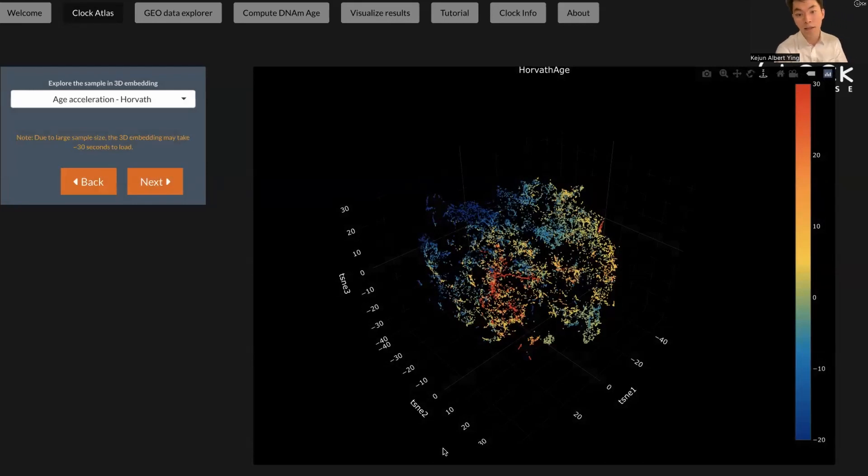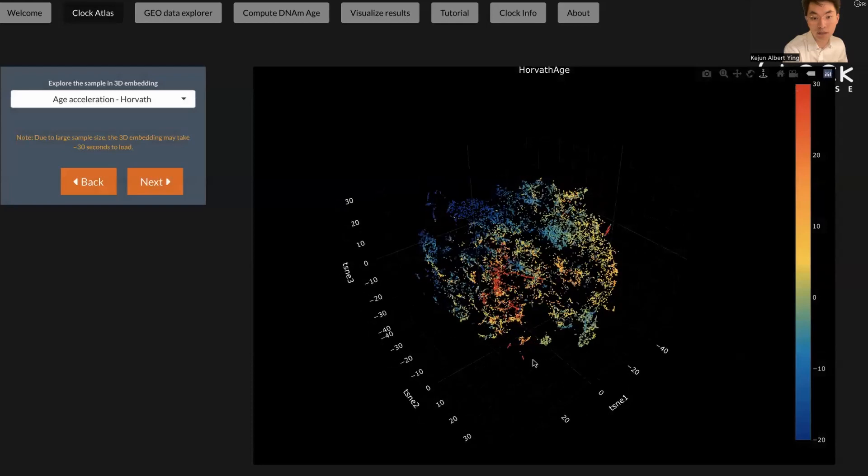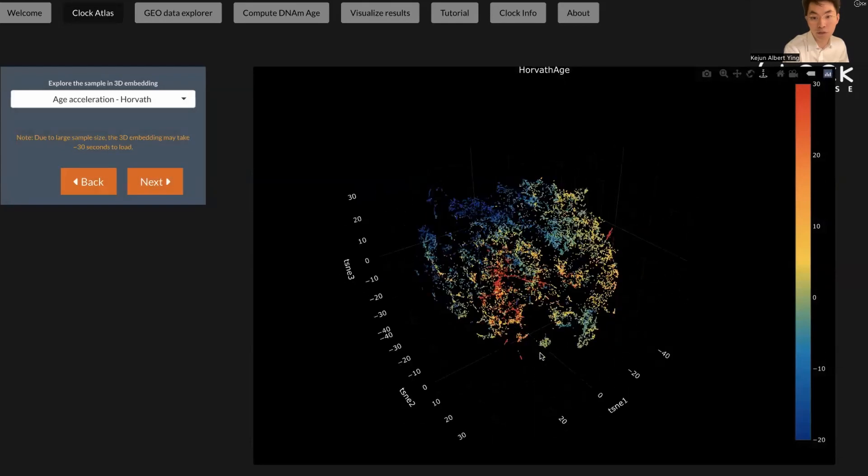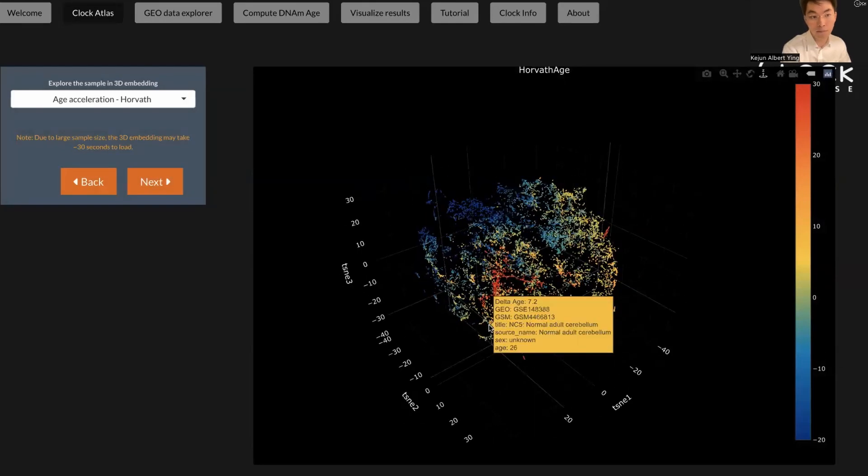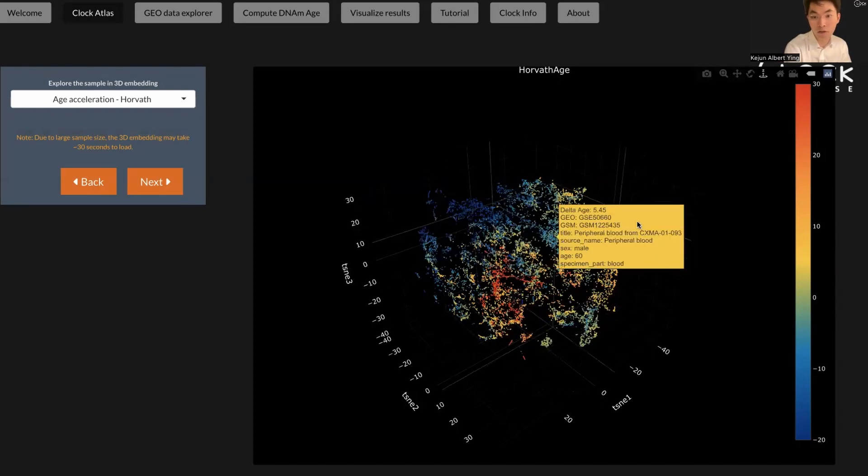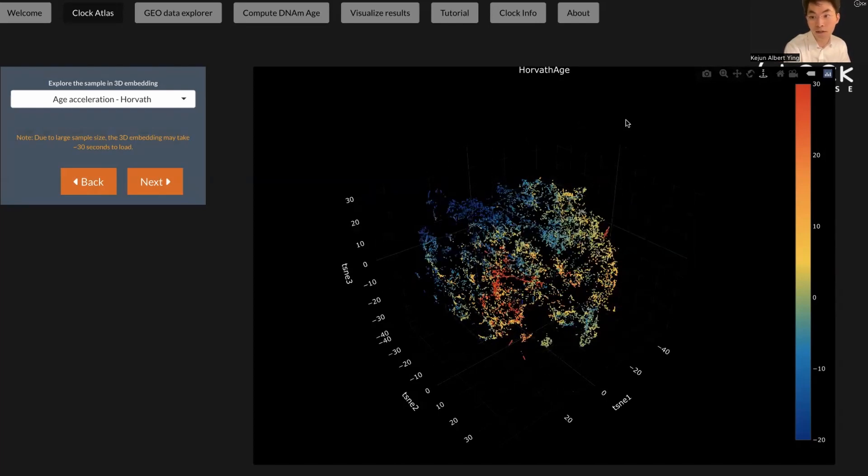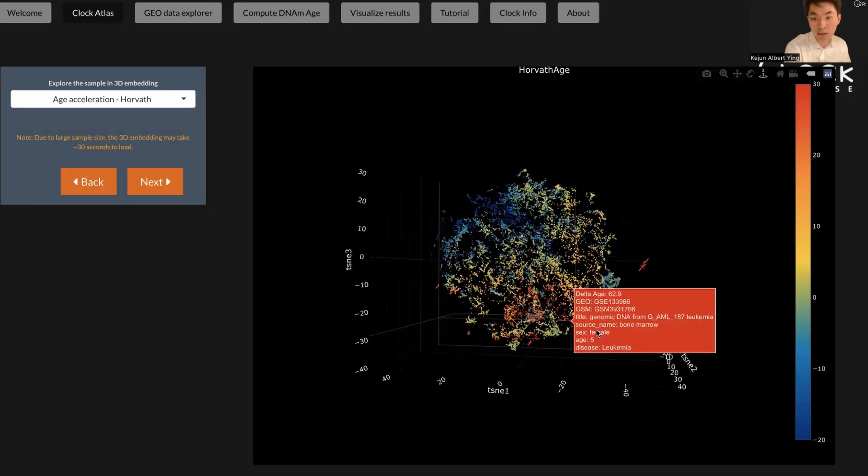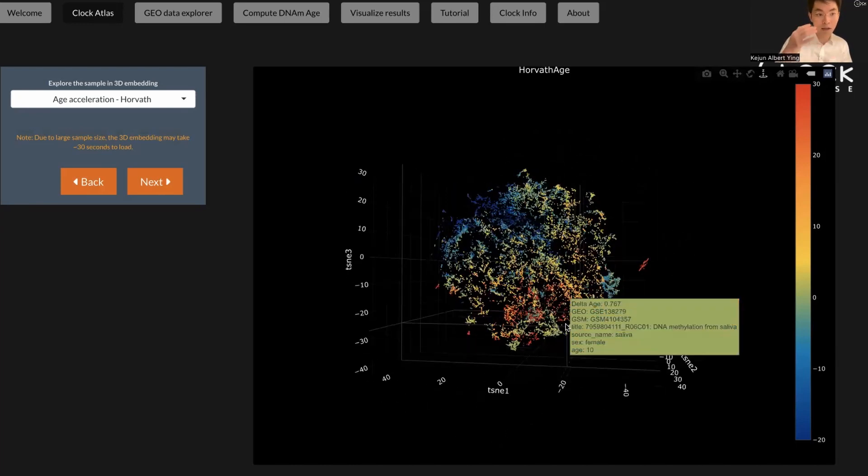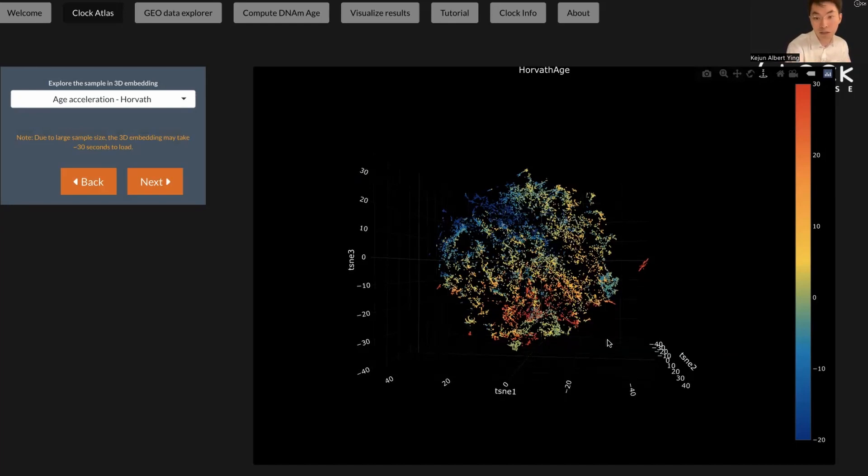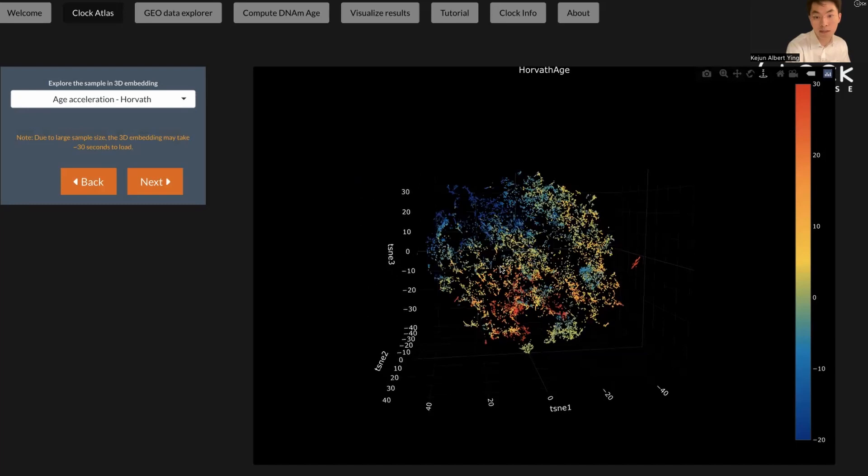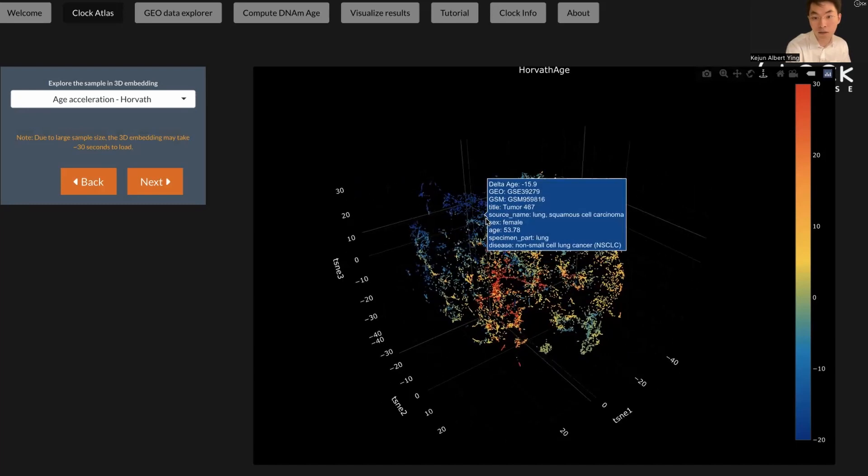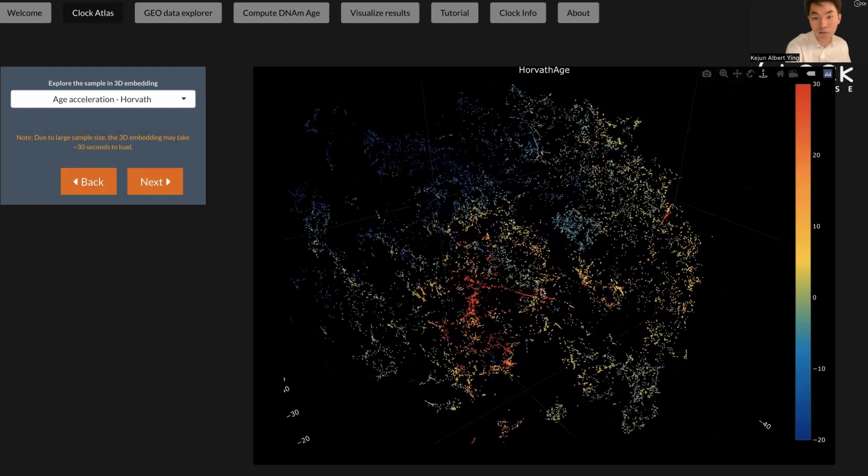Here it contains an interactive 3D t-SNE plot that shows all the GEO samples we processed for humans. The color scheme represents Horvath's age acceleration, which basically means that if the sample shows as red, it means they aged faster than their peers. Basically, their biological age is much older than their chronological age, and vice versa. The blue points means these samples are actually younger than their actual age.